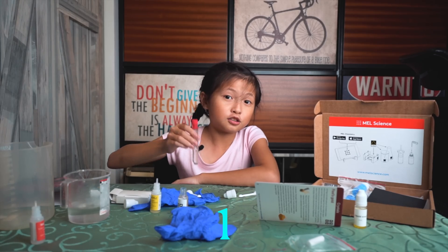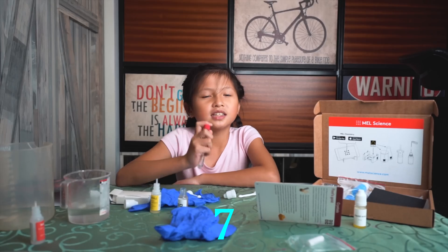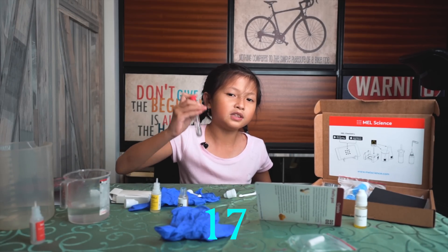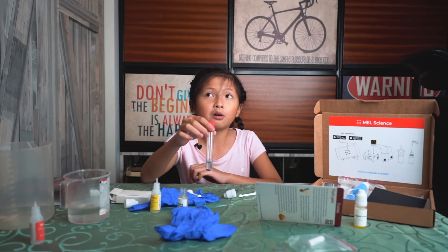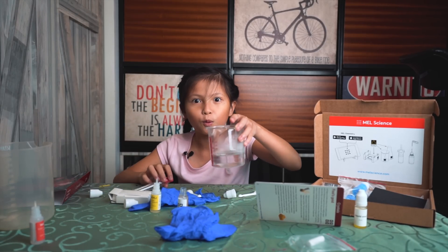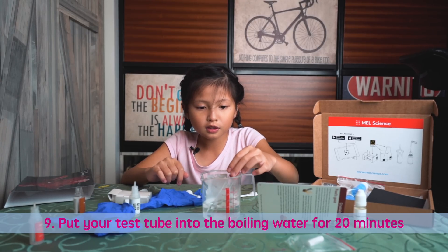One, two, three, four, five, six... seventeen, eighteen, nineteen, twenty. Next, when you're done, you need to get your boiling water and put your test tube in for 20 minutes.